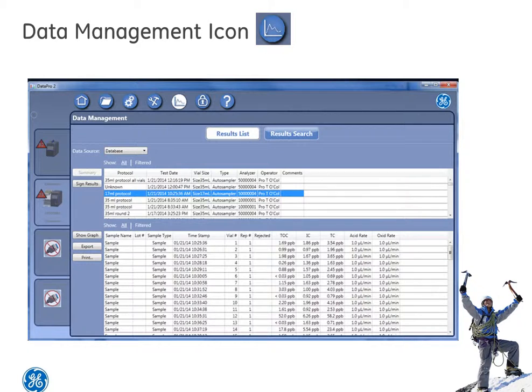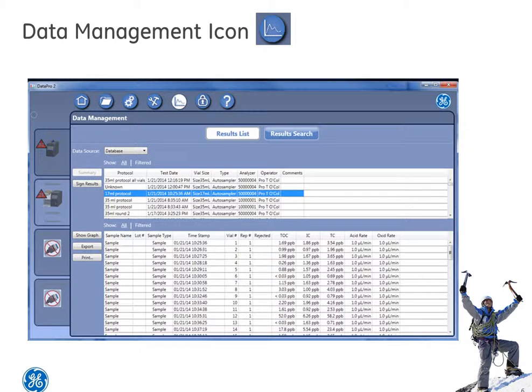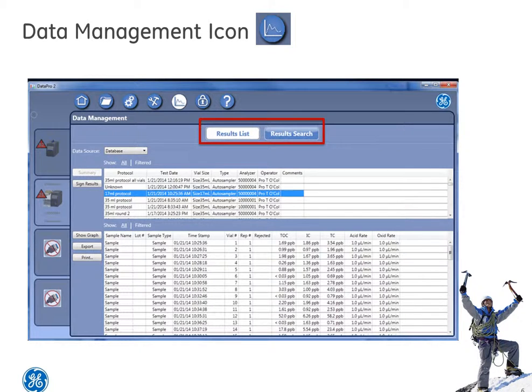The data management icon helps users to view, search, and print previous measurements and protocols. The results list gives you a tabular selection of the previous tests run on the unit, whereas the results search tab helps you get more refined in searching for data.